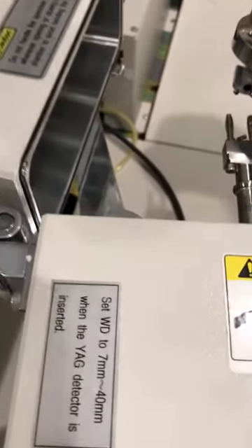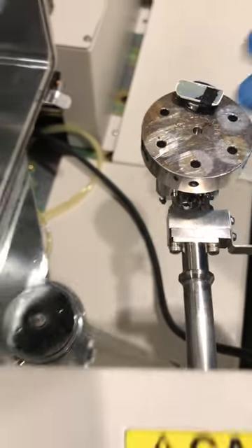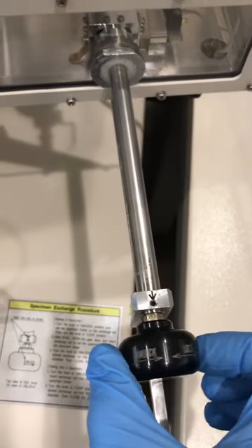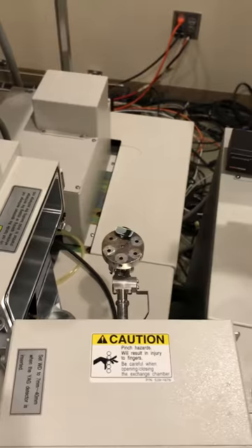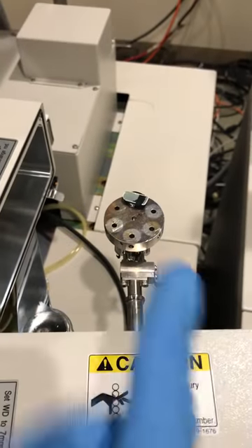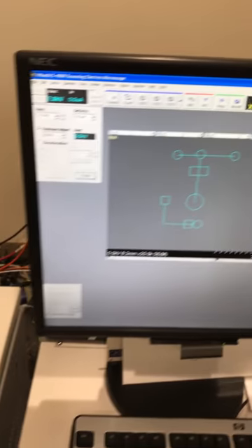I can pull the sample all the way inside and then lock it here — now the sample is fixed. Whatever orientation you insert the sample holder, that is the orientation you will see on the screen.